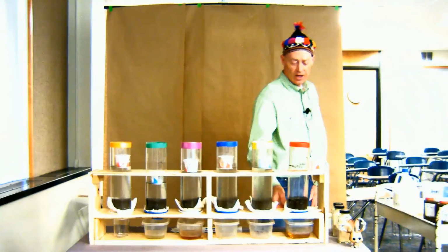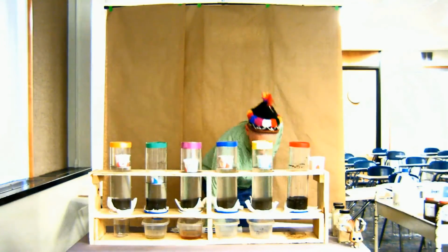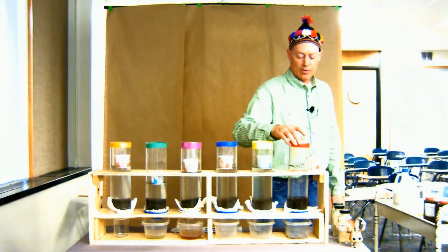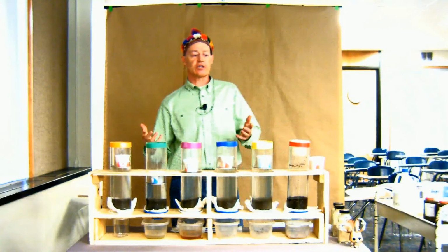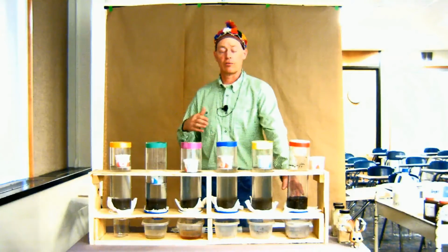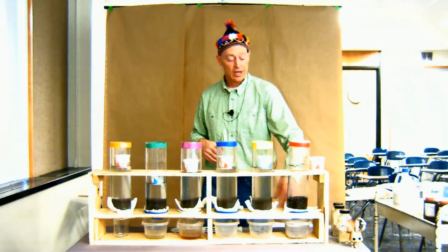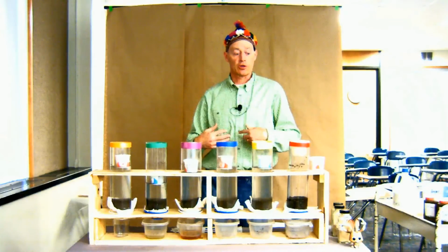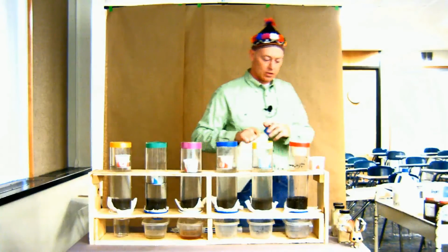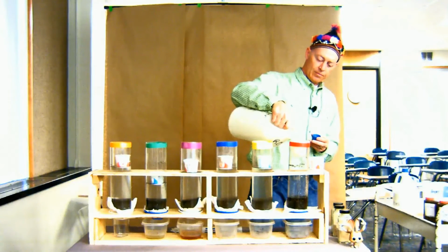And lastly, we have our coarse textured. So we already moved through 1 volume of water. We're gonna dump that out, and now we're gonna add water to this one. We've put sodium on the exchange sites. We still have a high electrical conductivity because there's still water in there. That's part of our, remember, that's part of our field capacity water. This is basically at field capacity. And so now we're going to reduce the electrical conductivity, but leave sodium on those exchange sites. So let's get our rainmaker out again and add a little bit of dihydrous oxide.